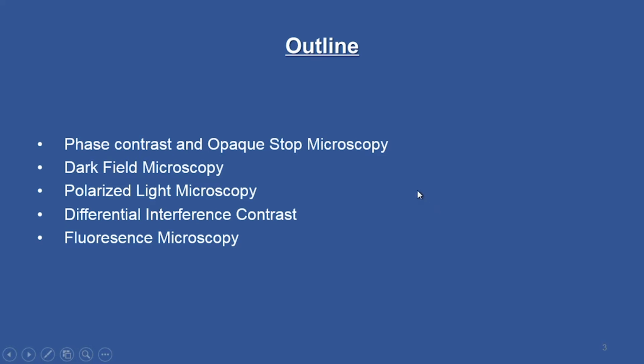I will be discussing the variants. I will start with phase contrast and its similar technique, opaque stop microscopy, and then dark field microscopy. I will go in this order, and we will show similar live demonstrations, like we saw for bright field illumination, for all these variants.